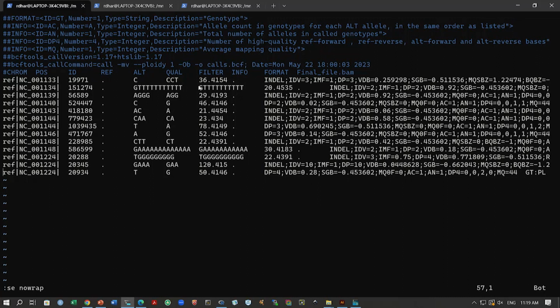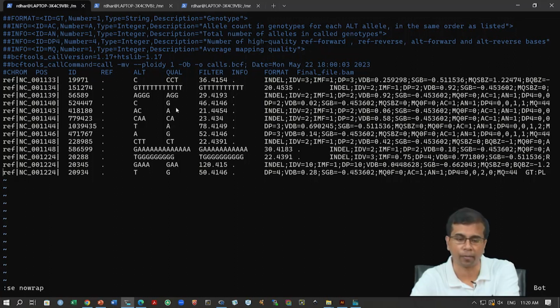Let us have a look at this. All around here you have these interesting variants, and there are a lot of indels, and then there are some SNVs. You can see these SNVs here, T2A or A2G, and again their positions and the chromosome are given. So, what we will do is go to the integrated genome browser and open up this alignment, and we will see whether we can actually see this variant, and whether it is an artifact of alignment or not.